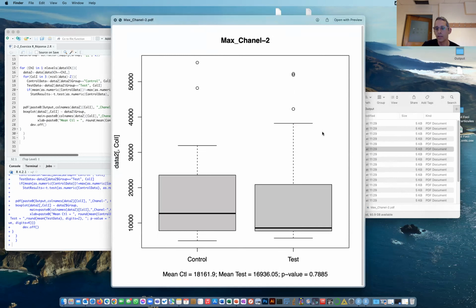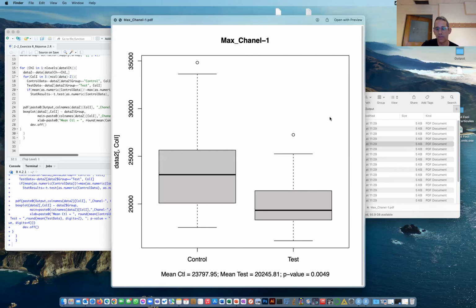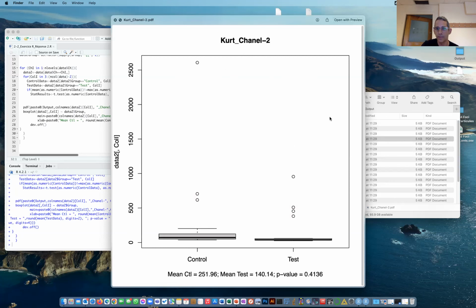cells. In this case, you see that this is the maximum intensity. You see that some of the images, you have 3 images and 2 images that have pixels almost at the limit of the camera. So maybe I can actually crop out these images, or I can look at them at least to correct if they are good or bad.